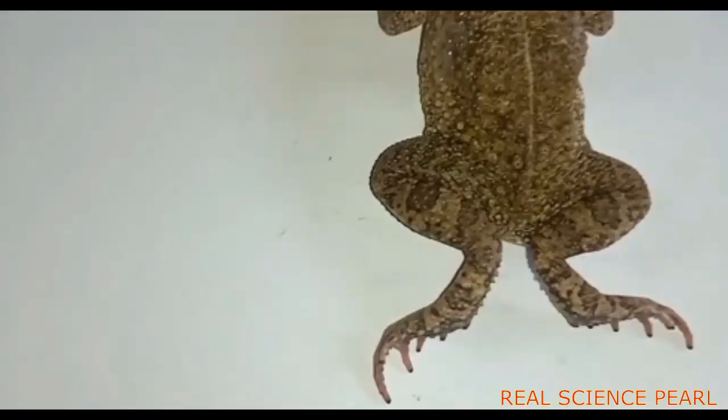Be careful: the fore limb has four digits whereas the hind limb has five digits. The hind limb has mainly three regions: the thigh, shank, and the foot.